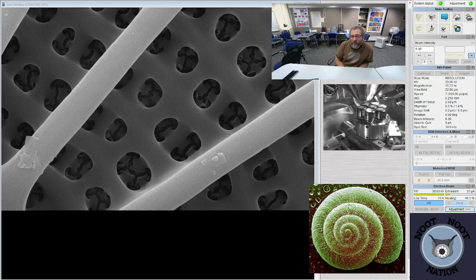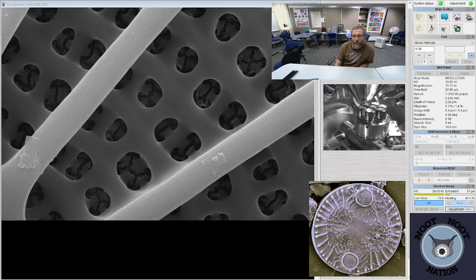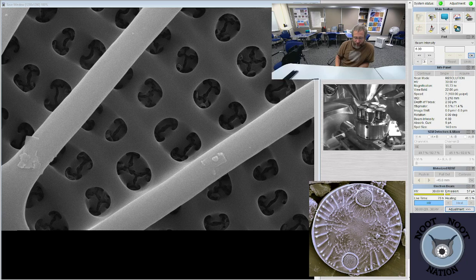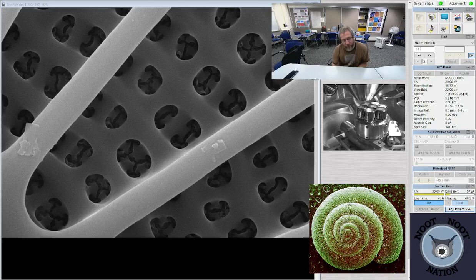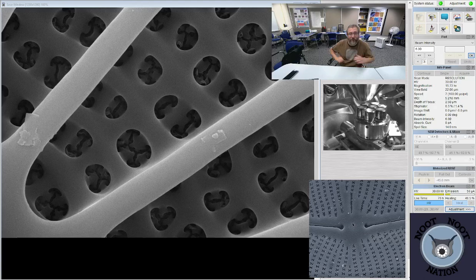Sam, I'm here to answer questions, so don't feel like you're asking too many. As long as I can keep up with them, ask as many as you like. Are the diatoms stacking? They are right now. We've got an entire stub just filled with diatoms, which is the best kind, in my opinion. They're not attacking me. They're attacking the screen. But definitely we see them.